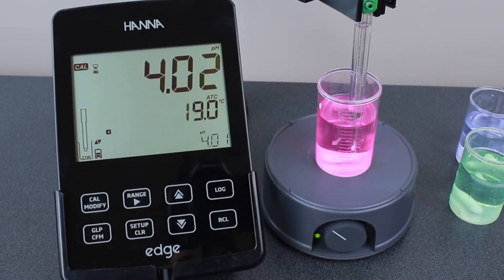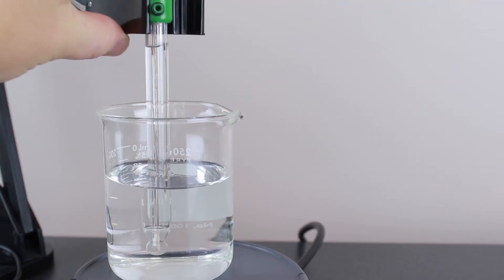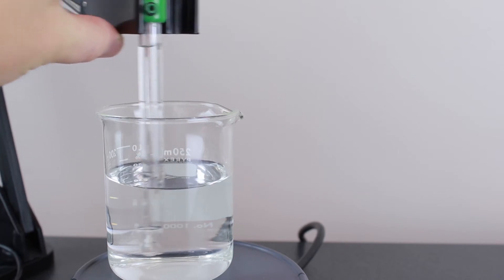Once stable, press confirm and the meter will ask for your second calibration point, pH 7.01. Rinse the electrode with deionized water and place it into the buffer.